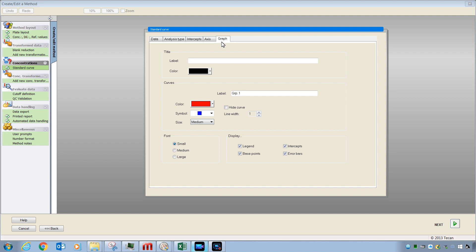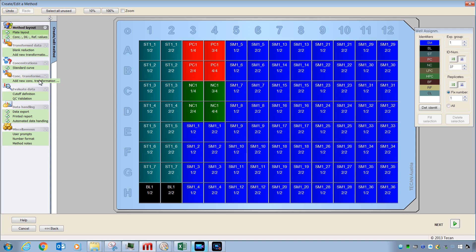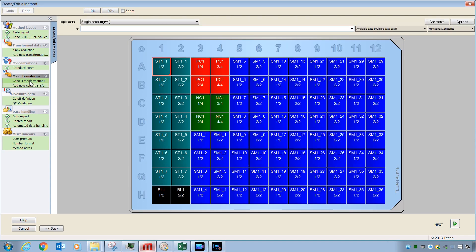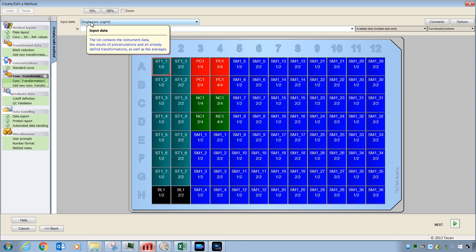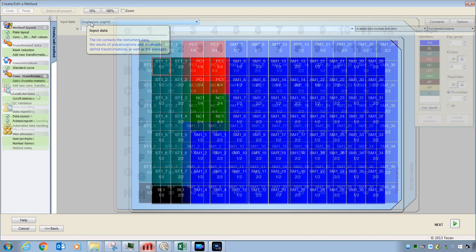One of these choices is Add New Concentration Transformation. Concentration transformations use input data that is concentration-related in order to generate new values and output. This feature is used infrequently, so we will skip it for now.